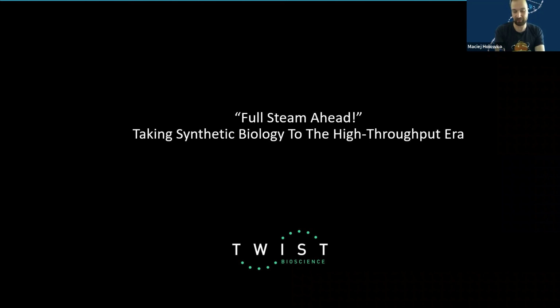If you need bioreactor checks and that kind of scale up, we have a dedicated facility in Victoria, in Melbourne, to do that. So we would just send your samples there and they would be processed there for the scale up. And we are also hoping to acquire a mini bioreactor system for our own facility. So we can do small scale up tests and then send your samples on to Victoria.